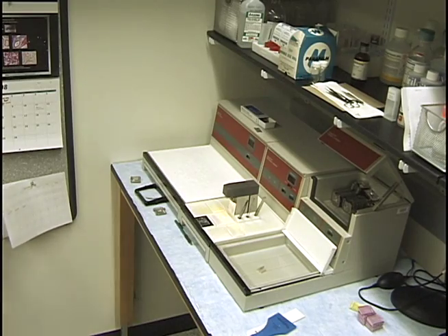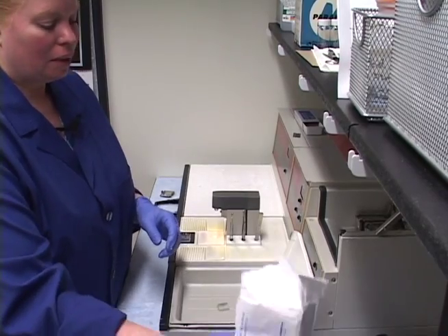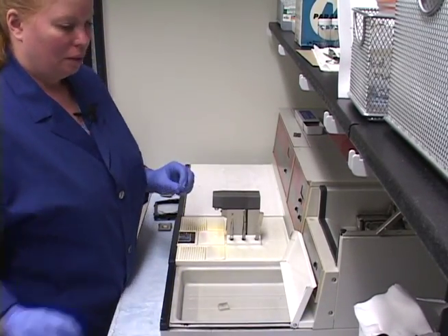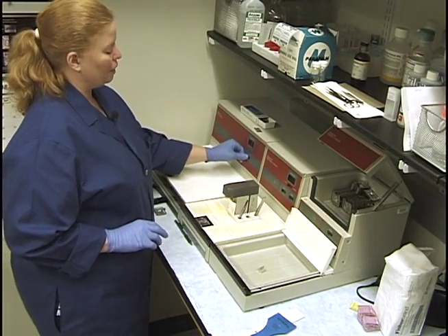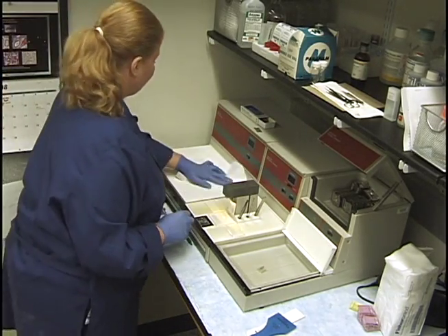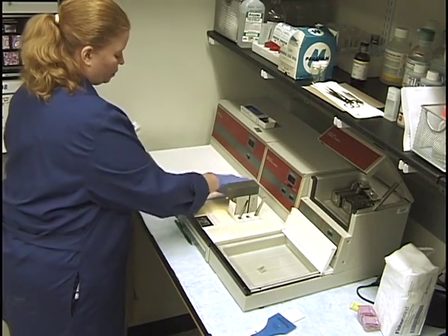I have gauze that I use also. I know I'm not going to be using this embedding center for a while, so first I'm going to clean it all up. I'm going to turn off the cold plate for now, and I'll give that a wipe down to get all the extra paraffin off of it.